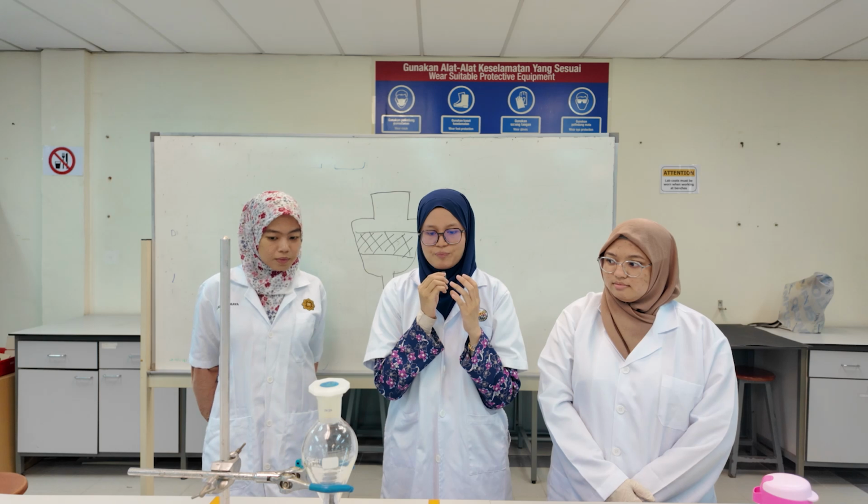So I will start the discussion. I will start with the introduction and the problem statement of liquid extraction. First of all, what is liquid extraction? Basically, it is a technique that we use to separate compounds.